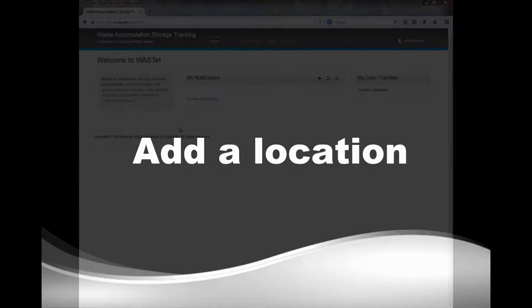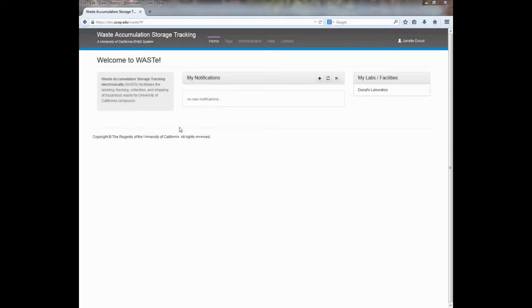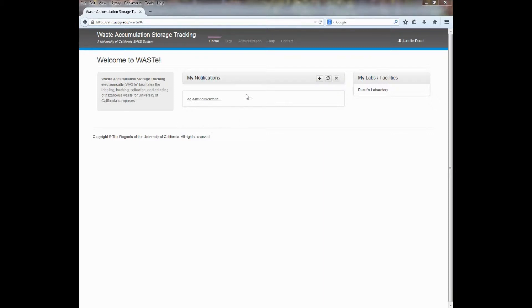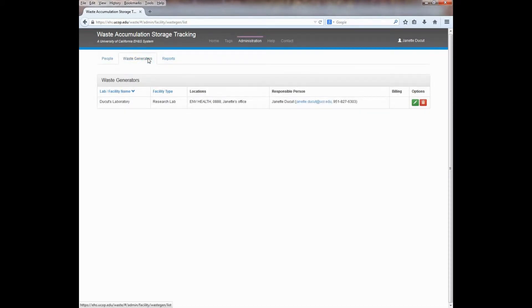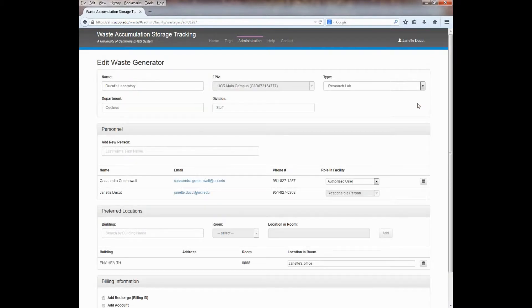As a responsible person or principal investigator, you can add locations to your laboratory or facility. This must be done before generating a tag or label for waste pickup. To add a location in the system, click on the Administration tab, then click on the Waste Generators tab. When you get here, click on the green Edit icon next to your lab or facility name.